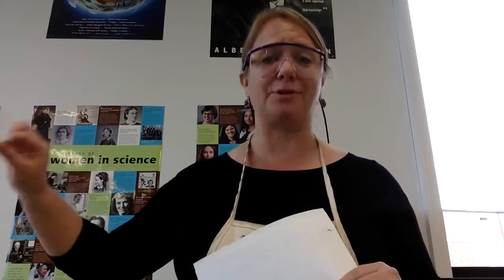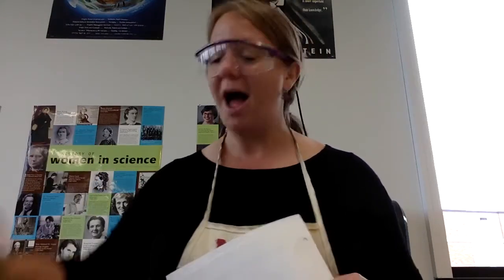Now remember, this is not your lab report, but all of the pieces on here will help you write your lab report. All right. This is now considered a lab contaminated sample, so I'm going to throw this away. That'll be for cleanup. I'll take care of that while you go write your lab report.